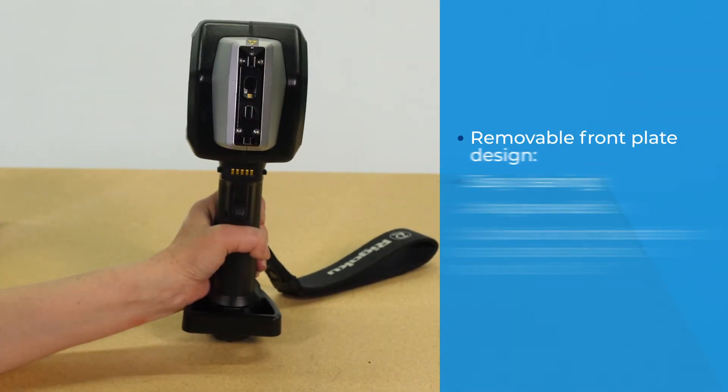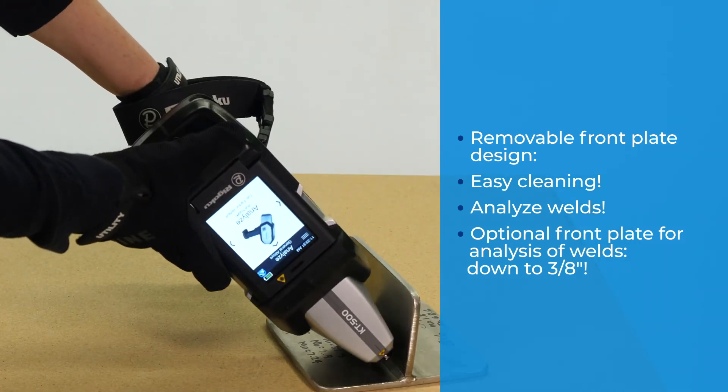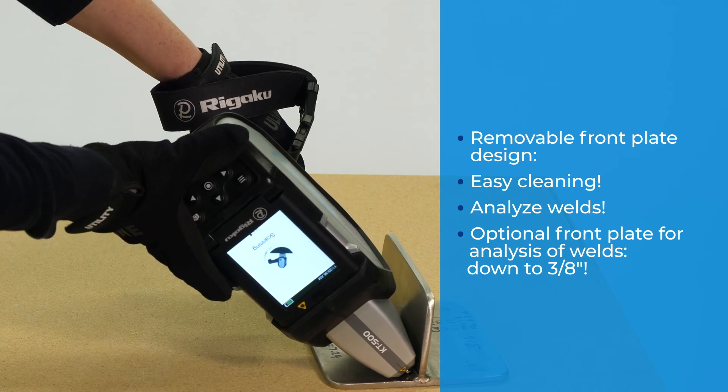The removable front plate design gives easy access to the window for regular cleaning and the snap-on optional weld front plate to reach into corners, all by using the integrated sample camera to line up the measurement.